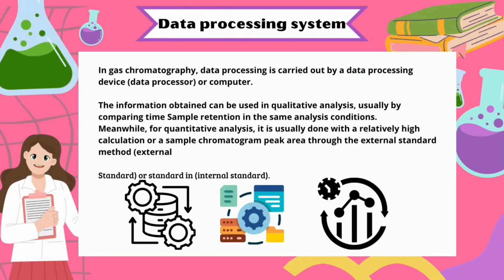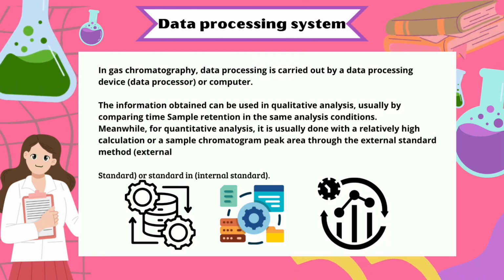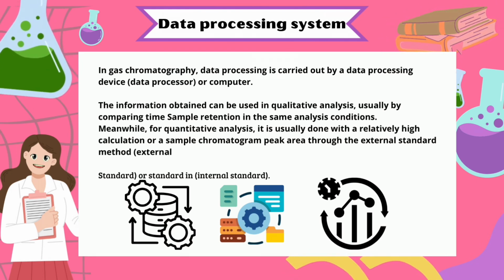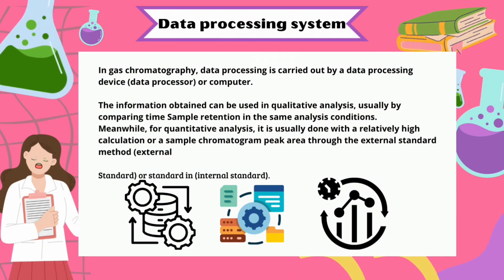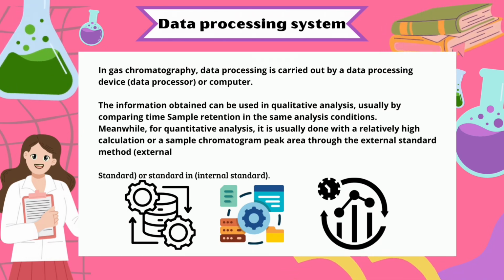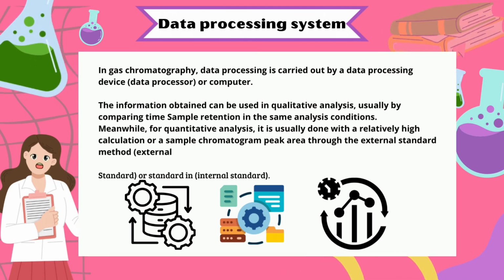In gas chromatography, data processing is carried out by a data processing device, data processor, or computer. The information obtained can be used in qualitative analysis, usually by comparing sample retention time under the same analysis conditions. Meanwhile, quantitative analysis is usually done by comparing the sample chromatogram peak area or height through the external standard method or the internal standard method.